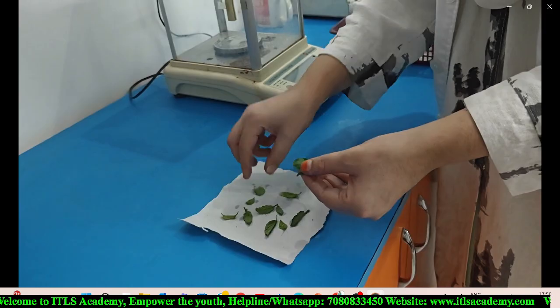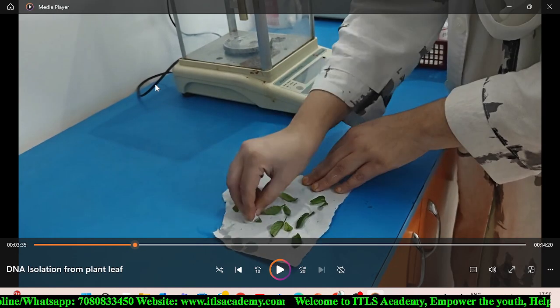Place it straight onto the filter paper, and with the help of another filter paper we wrap it, so that the moisture is easily removed.